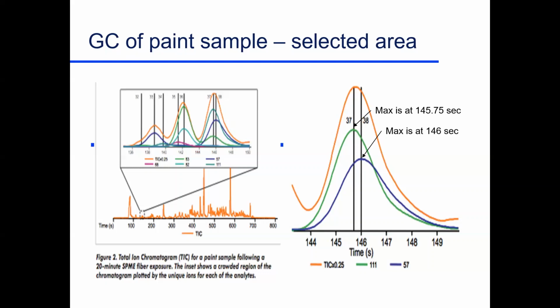And so by that, we can see, okay, there's a set of pieces that fit this particular compound. There's another set of pieces that fit this particular compound. And what the mass spectrometer does, it looks for things that are moving perfectly in symmetry. And so all of these ions, all of these fragments, bits and pieces that blew up, come out at exactly the same time. Poof, they're there.